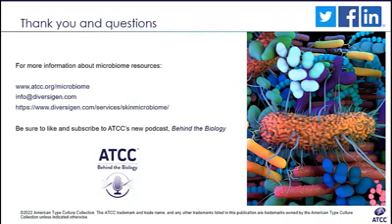Now, this question's about a specific genus. Is something known about Ralstonia in context with the skin microbiome? For example, can this genus be considered a contaminant due to low biomass or be a normal part of the skin microbiome? Yeah, that's a great question. I am not very familiar with the genus, but I think we probably have to see if you see it consistently in your reagents. I know of some bacteria that are intrinsically present in the reagents that you use during DNA extraction. So I think we should check the blank controls that you use during the process of DNA extraction, just to make sure that this is not coming from your reagents somehow. Okay.